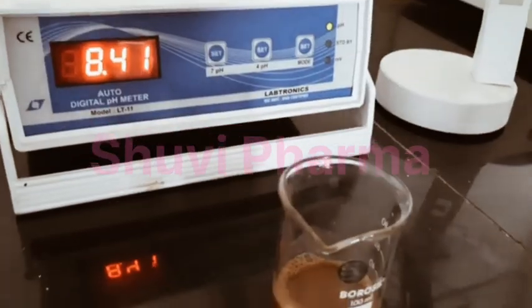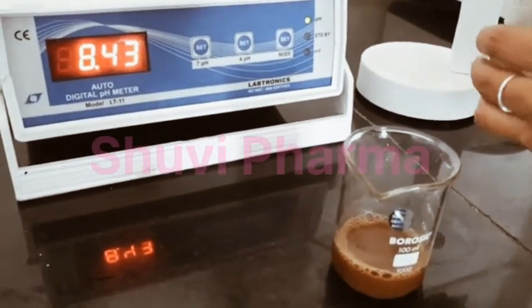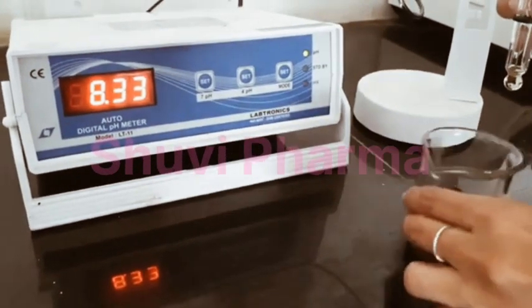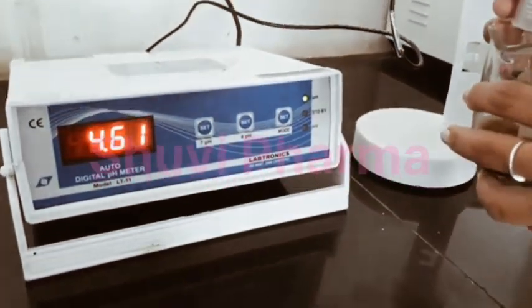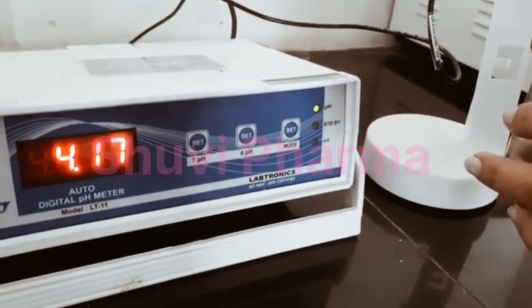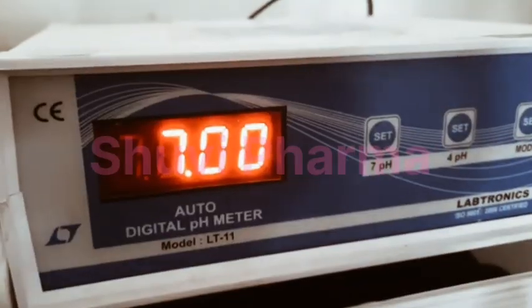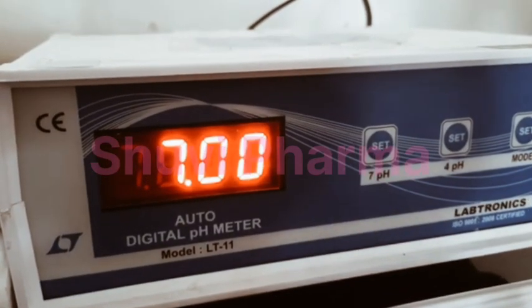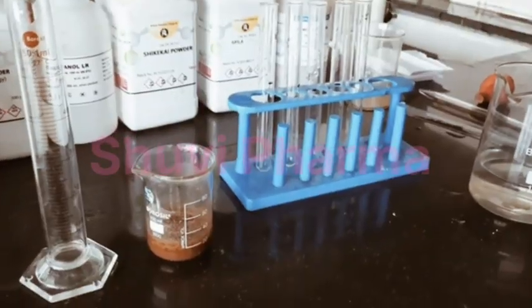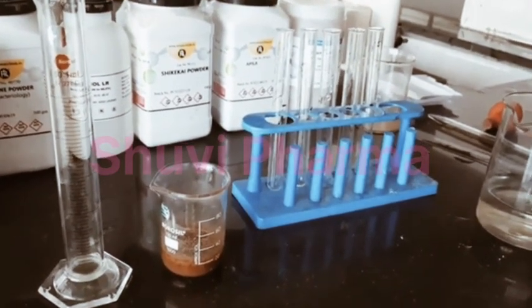So now we will check the pH of the shampoo. Is it 7 or not? So now we will adjust the pH to 7 by adding the citric acid solution to it. So here we have adjusted the pH of the shampoo to 7. Now we will perform foaming index, that is an evaluation parameter, to determine the foam of the shampoo.